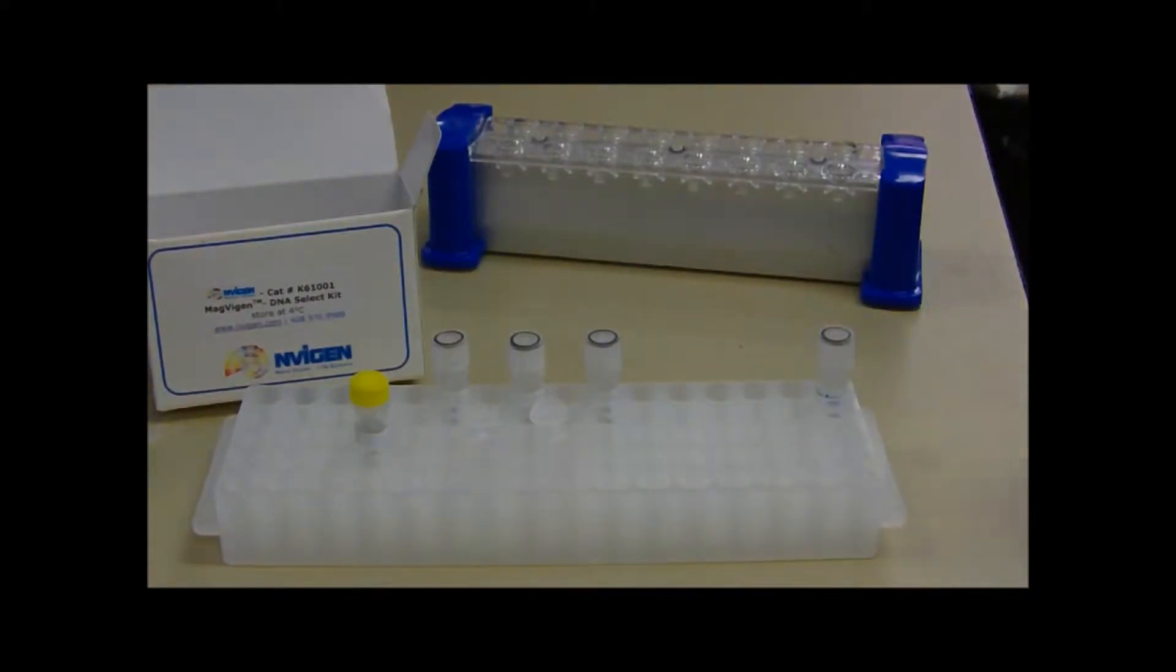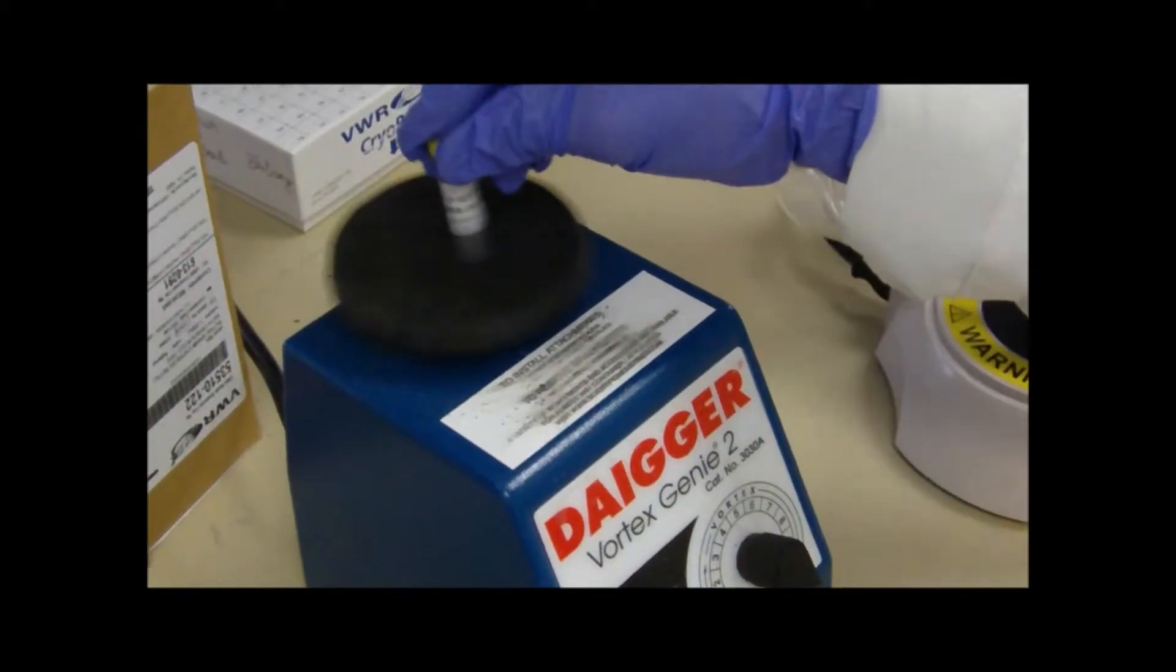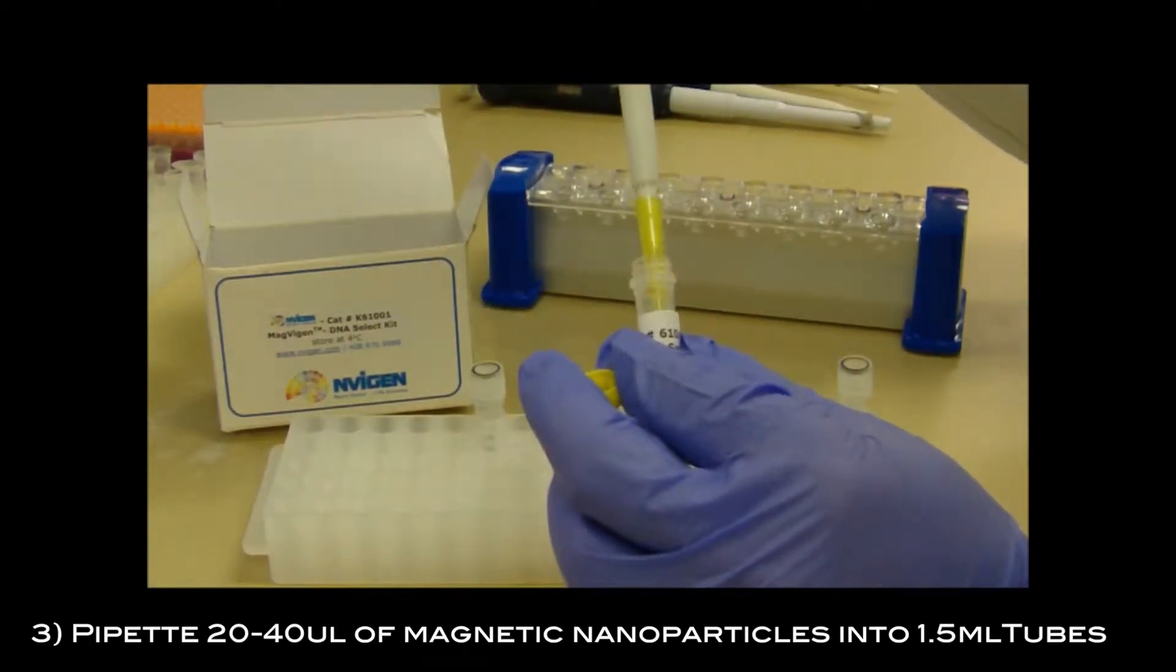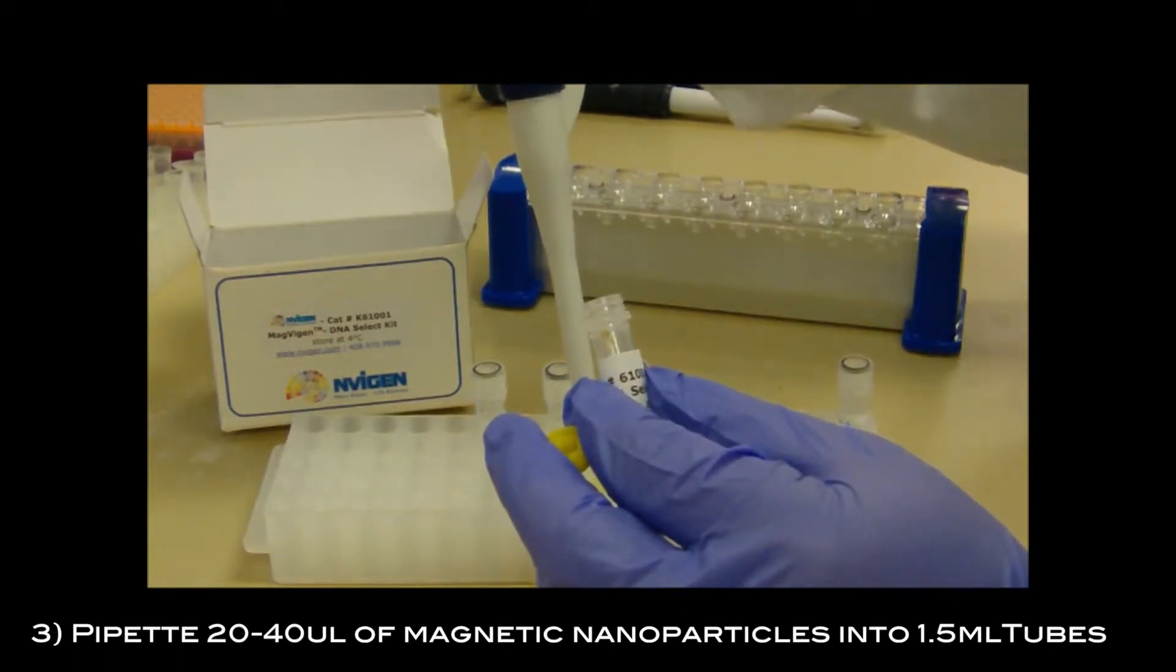Vortex nanoparticles to mix well before use. Take 20 to 40 microliters of magnetic nanoparticles and put them into clean 1.5 milliliter Eppendorf tubes.